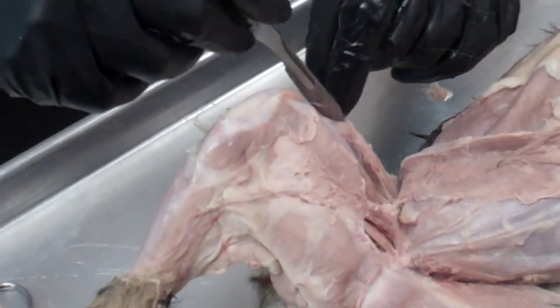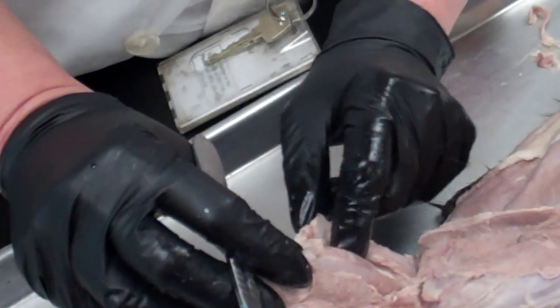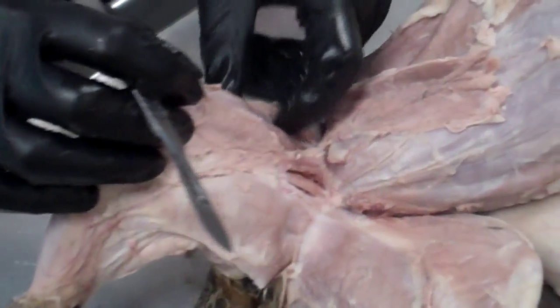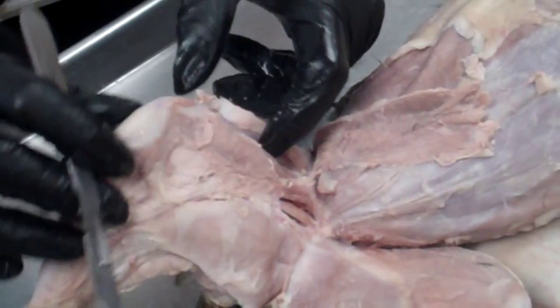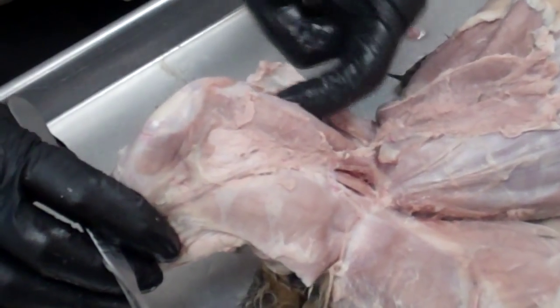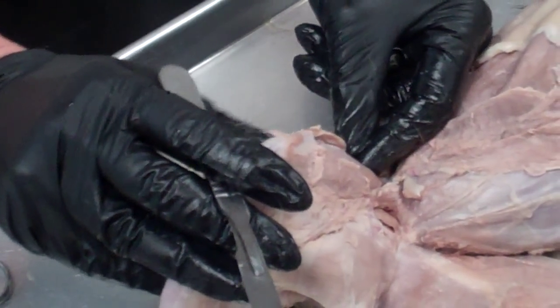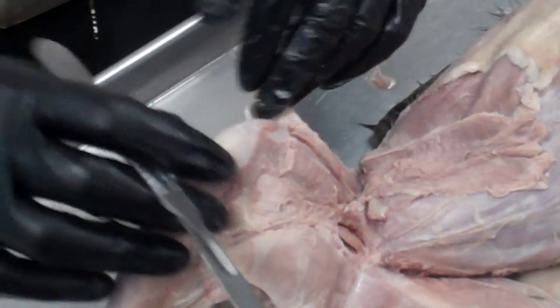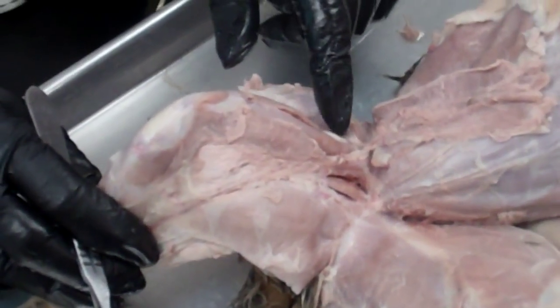I'm going to remove this and cut a little bit here to get it out of the way. This outer muscle right here — which I'm going to separate at its natural separation line — is called the vastus lateralis. You'll be able to see it from the backside a little bit better right here.